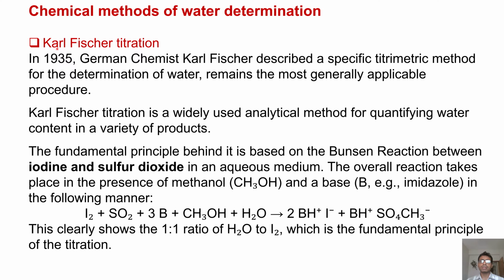But the Karl Fischer titrator is just a single machine. Okay, it's a small machine, like a small centrifugation machine. The size is like that, and it's not so complex as the azeotropic method, because the azeotropic method requires a round bottom flask, a condenser, then a graduated tube, a lot of things. Moreover, solvents are required, very critical things. Okay, so that is why Karl Fischer titration has gained much attention from analysts and chemists.